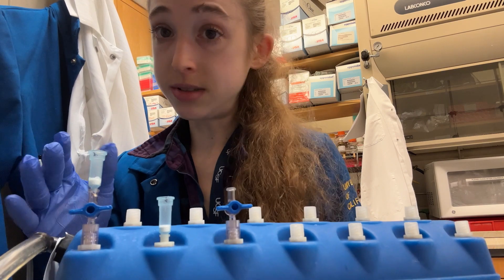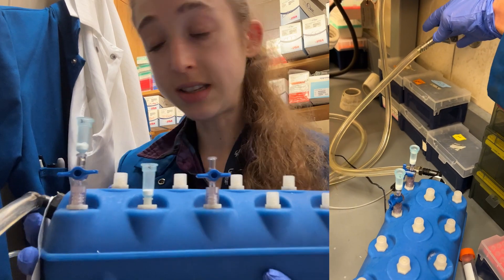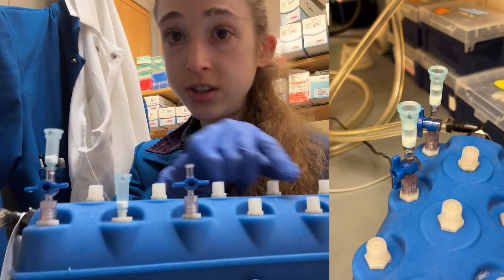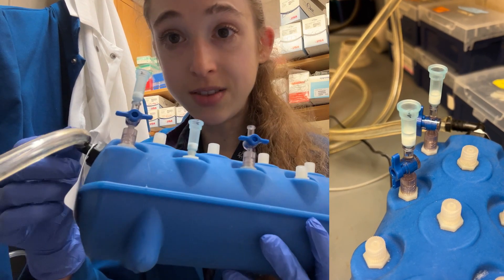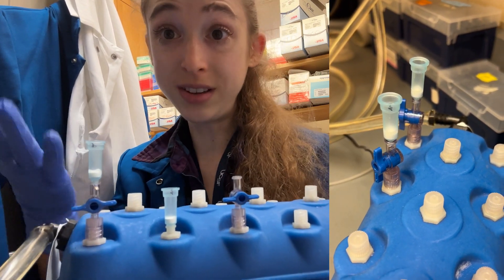It comes in really handy. The first time I saw one of these I had no clue what it was, so if you're wondering — it's just a vacuum manifold. You put your tubes in here, attach the vacuum line, pull the liquid through, and hopefully it helps you.